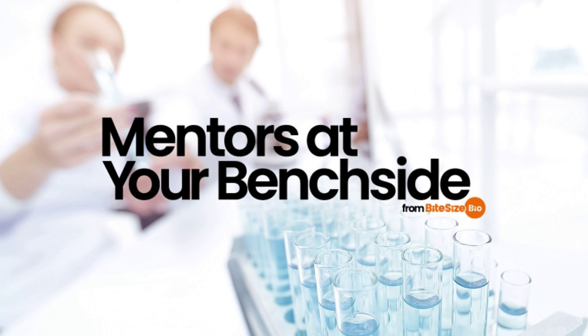X-rays, well, they're the worst of both worlds. Their wavelength is about 1 angstrom in an X-ray diffraction experiment, and is too small to interact with an optical lens. They would just pass straight through it. Nor are X-rays charged, so they cannot be focused using electromagnetic lenses either. They're a terrible way to illuminate a sample, really. Consequently, X-rays scattered by crystalline samples in an X-ray diffraction experiment must be focused mathematically and by the experimenter at a later point in time.